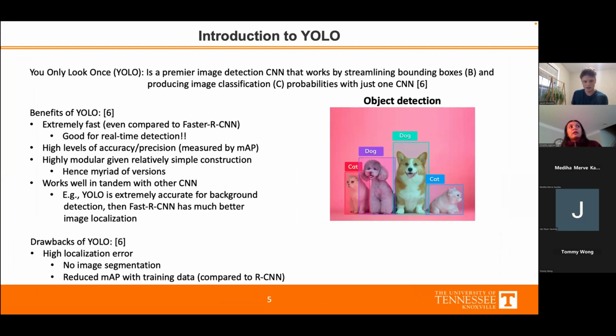Okay, so in all the beginning versions, especially in YOLO V1, they had this concept of providing the bounding box with respect to the grid. So there was no concept of anchor boxes. So what are anchor boxes? They are predefined boxes that you create. For example, in our case, we have voids. So we know that our voids, it depends on the data that you provide.